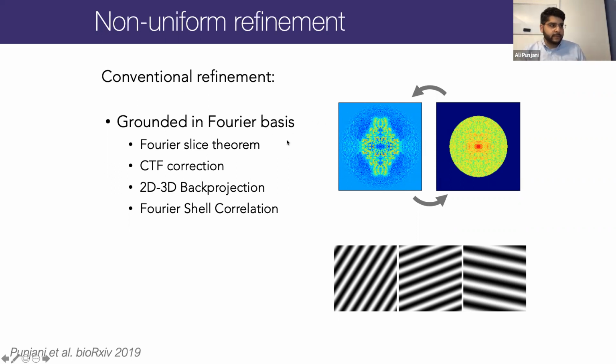operations that we do are grounded in the Fourier basis. It's very natural, if you're a crystallographer or any other kind of structural biologist, to think of a protein structure or an atomic structure of any kind in its real space form, where you have electron density, or a Coulomb potential, whatnot, atomic coordinates in real space. And then you have the dual of that related by the Fourier transform, which are the structure factors, or literally each Fourier component representing a spatial plane wave of density, a spatial frequency of increasing and decreasing electron density. Together, adding up all of these plane waves makes up this density structure.